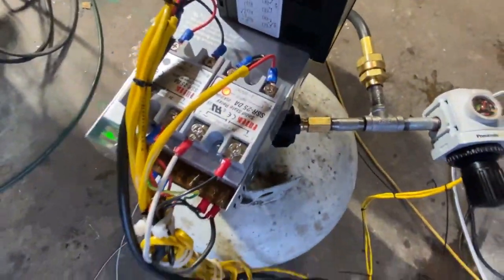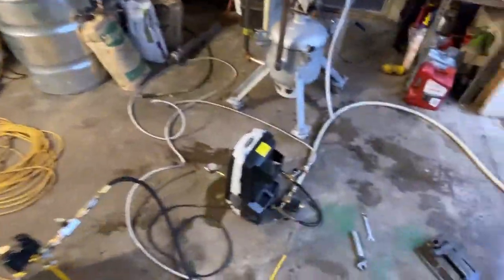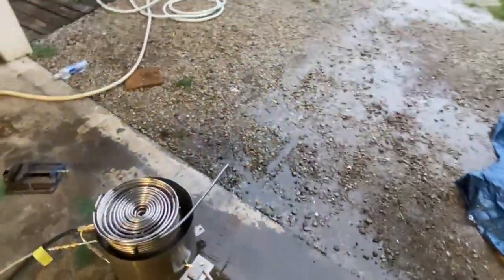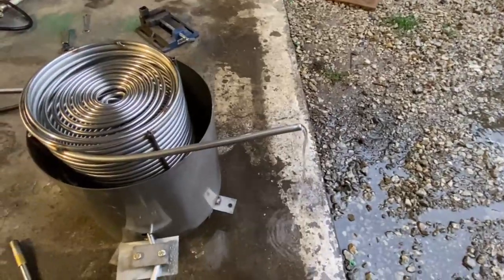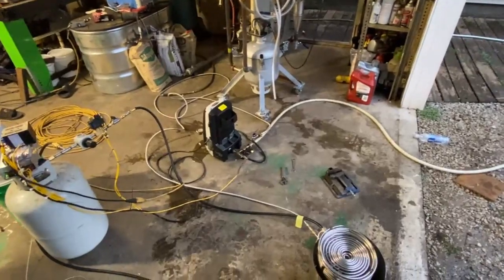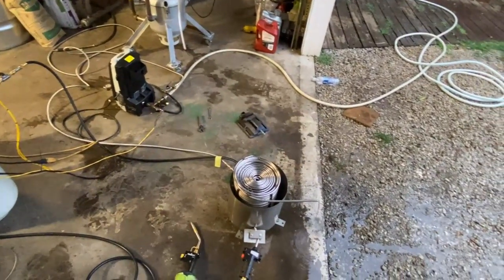Basically, we have two SSRs here — power supply and your PID controller. We have a solenoid here that shuts the water off. You don't just do this right here when the system shuts off. If that solenoid over here wasn't in place, this is what would happen when we shut everything off. But because that solenoid's on there, we don't get that — it's turned off right now, so it won't activate, but that's typically how it works.